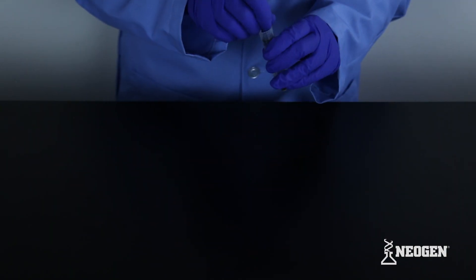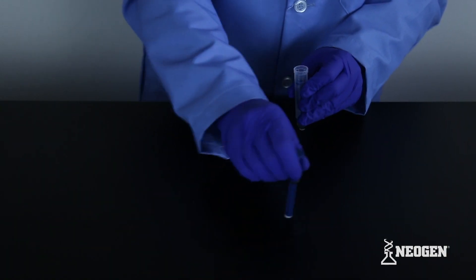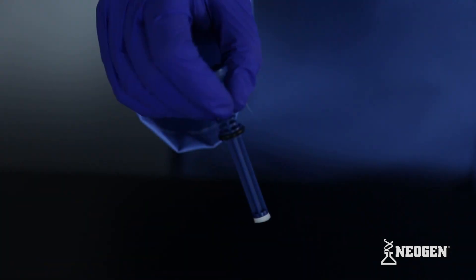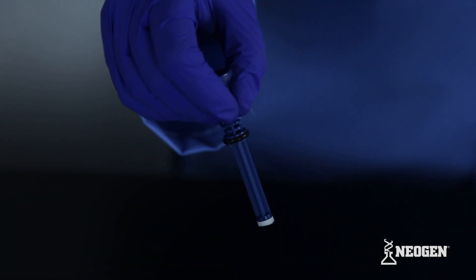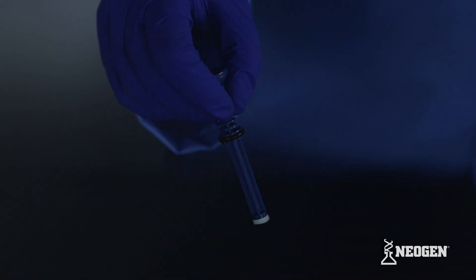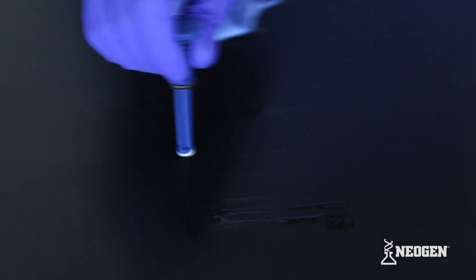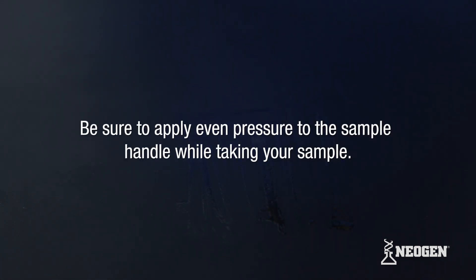Remove the plunger portion of the sampling device and place the end with the pad on the surface to be tested. It is important to make sure you do not touch the sample handle below the rubber stopper to avoid contaminating the test. To sample, criss-cross a 4 by 4 inch square on the surface to be tested. For best results, sample in a back and forth motion within the sampling area as shown. Be sure to apply even pressure to the sample handle while taking your sample.